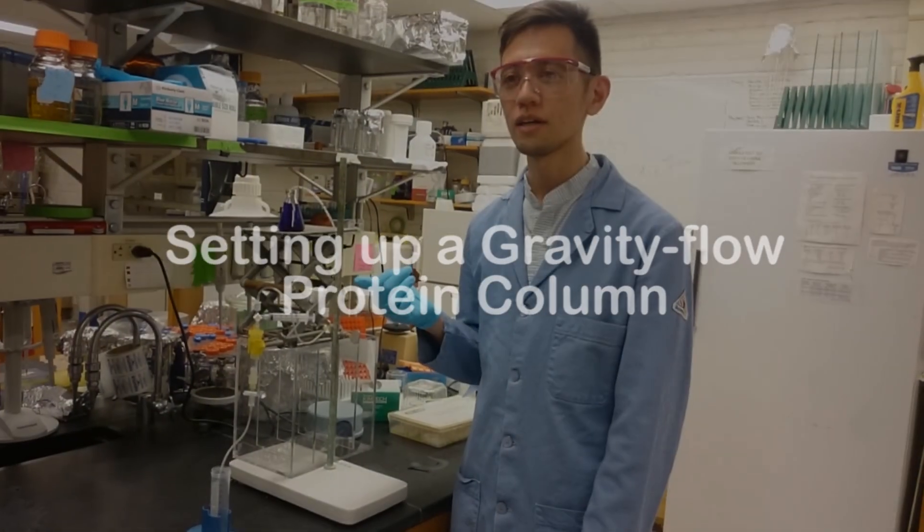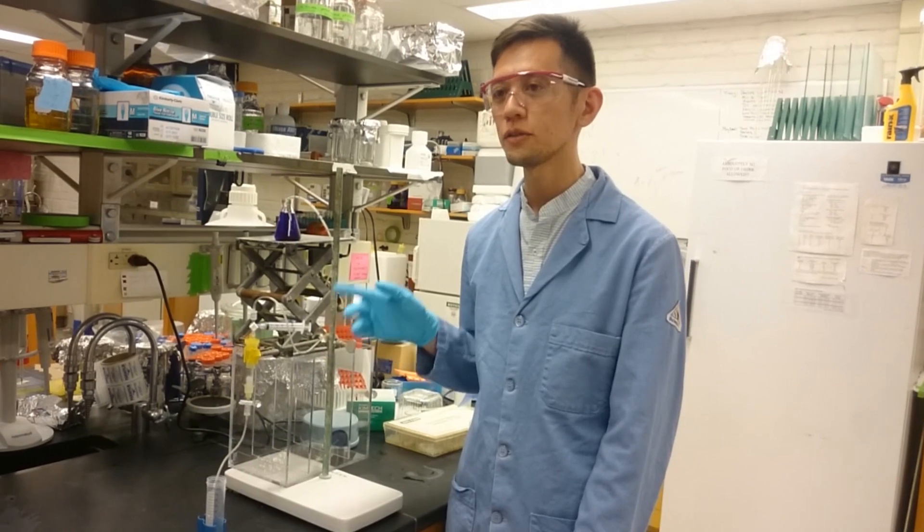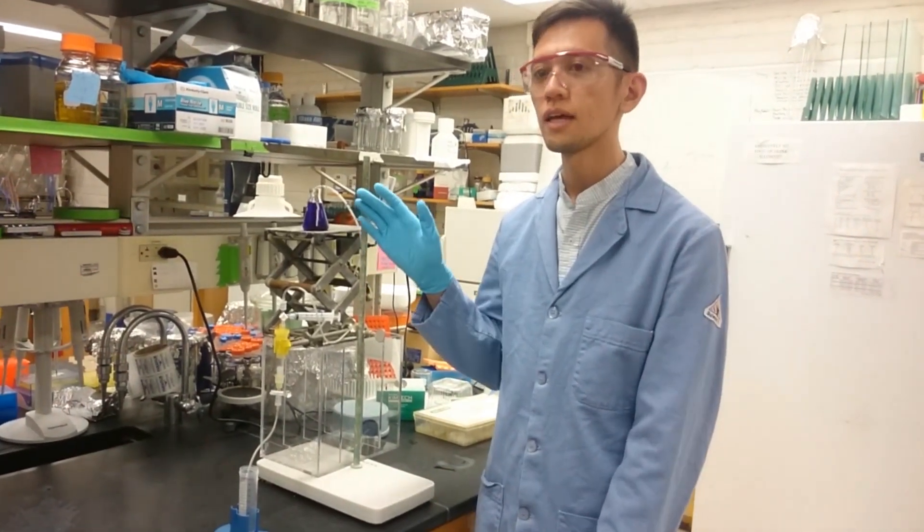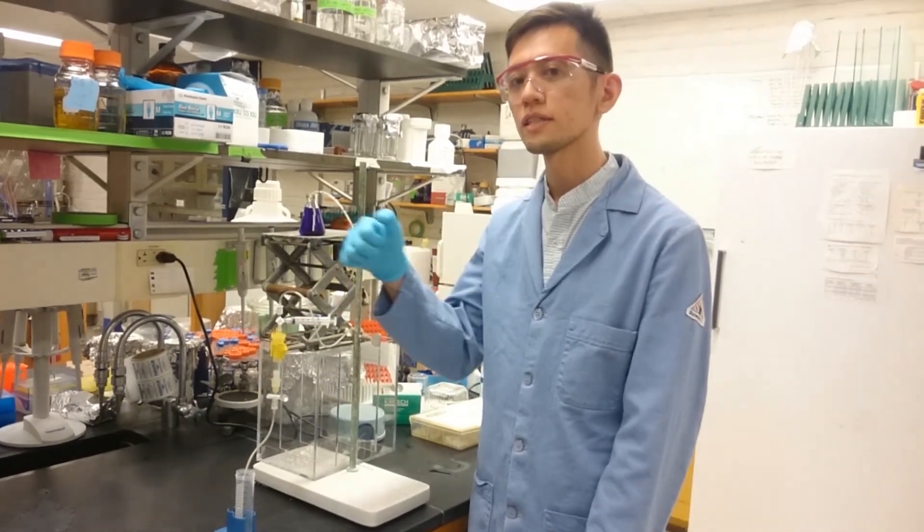I'm going to show you how to run a protein purification column by gravity using this tubing setup, which will make it a lot easier because it will run automatically without you having to pipette all the time.